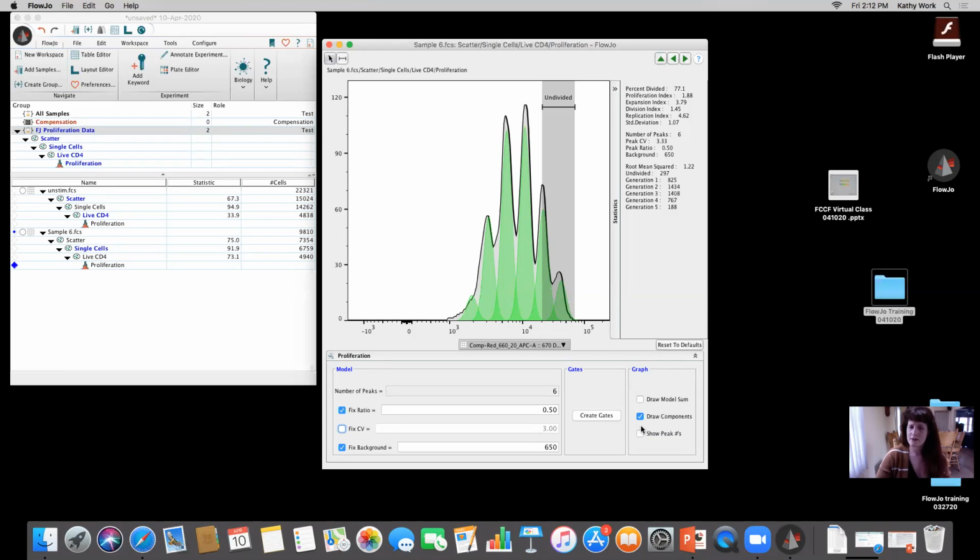I do know that CFSE is pretty bright, and you do have to titrate it down. That's my own personal experience from users that I've seen, that the CFSE can be kind of screaming off the charts. And that isn't always a good thing. Keep that in mind, that that's not always what you want. So be careful and be cautious of that. But there are different options, and I would say explore those options to see what fits best for your needs and your panel, because typically when you're doing proliferation, you're building a couple of other different markers into the panel.